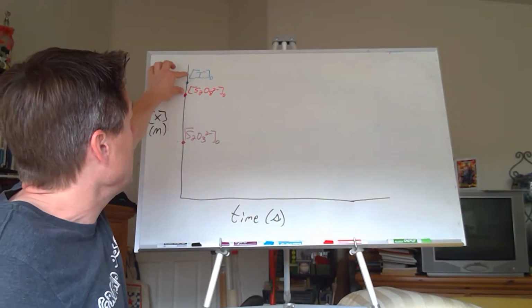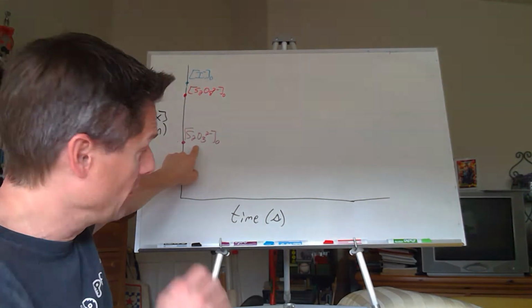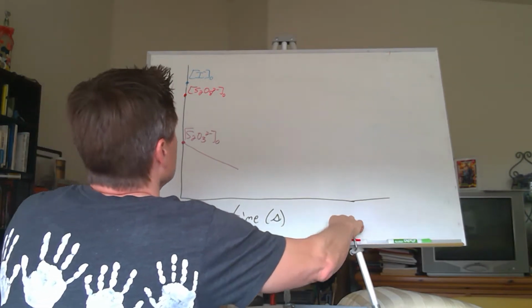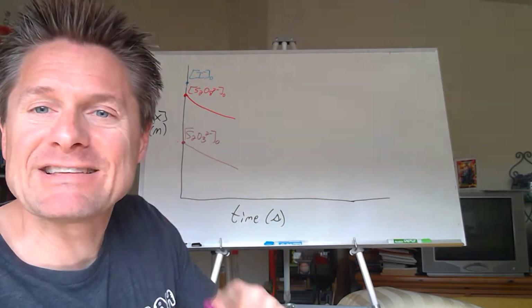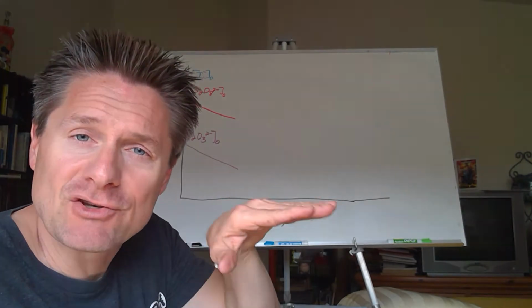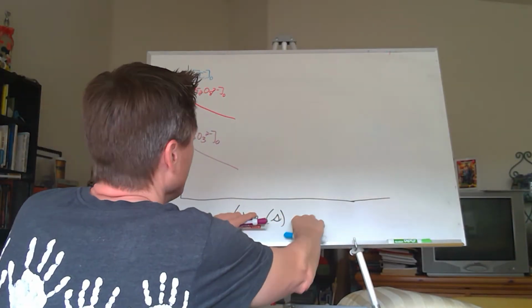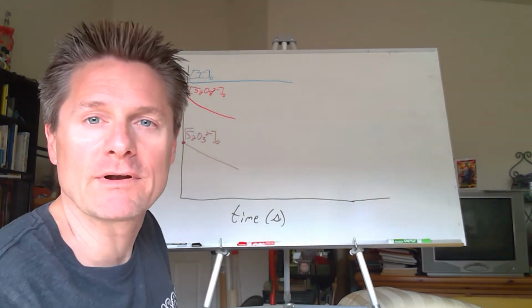So these are our main reactants, the I- and peroxydisulfate, and this is the thiosulfate that's supposed to go to 0. So over time, this is going to drop, right? This is going to drop. But remember, the I- is recycled. As long as there's thiosulfate ion in there, in reaction 2 on the prior board, the I- gets regenerated, so the I- stays constant over time, right?